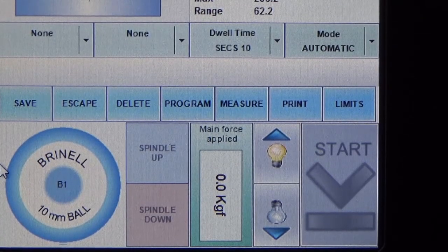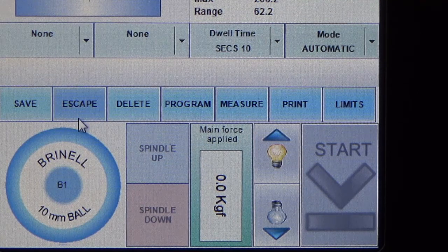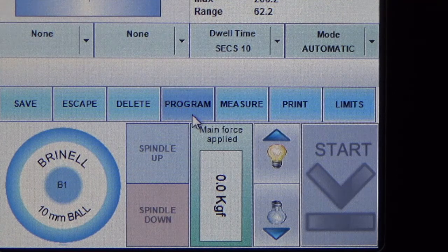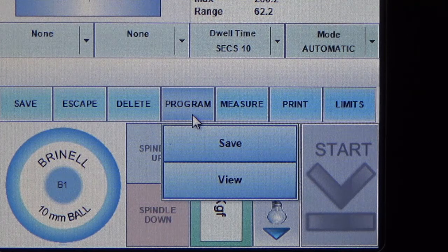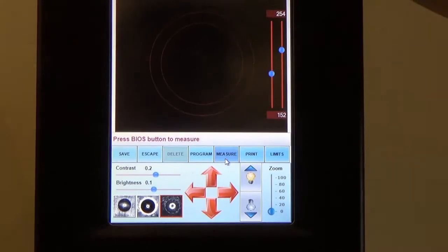Further down, you can see a Save button for saving all your readings into the archives. The next tab is Escape, which serves as a back button, and Delete for removing any unwanted measurements. Program is for saving different programs — for example, if you have different samples which require different loads as well as indenters, you can save them into various programs and load them depending on which sample you are testing. The Measure tab is for measuring the indentation once the measurement is done.